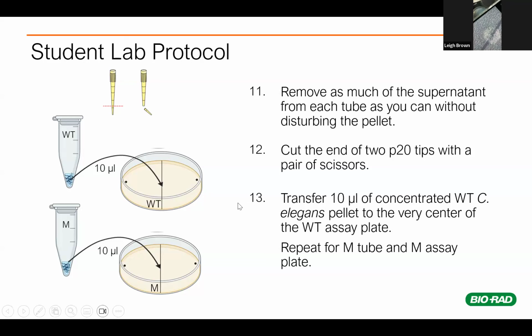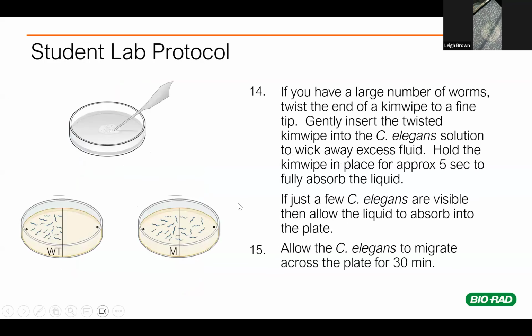So I don't know if you can see this, but see how the worms are kind of trapped in that little bubble? Is that working up there? Yeah, I can see it on my side. Okay. Now you can kind of see how they're doing the Harlem Shake in there. I'm going to take the Kimwipe and just roll it up and suck up some of the liquid, and you'll see how they'll start crawling out of that bubble. So give me just a second and I'll do that.